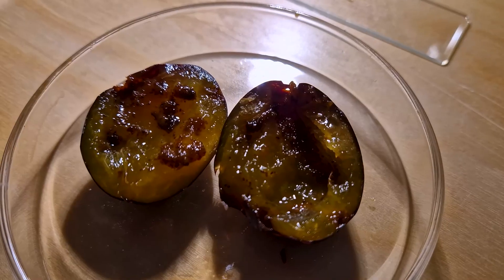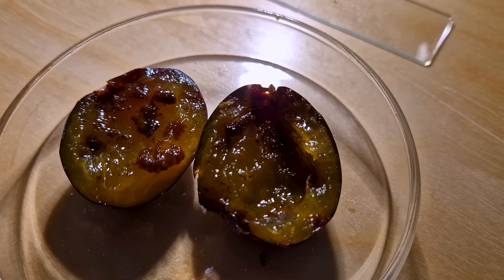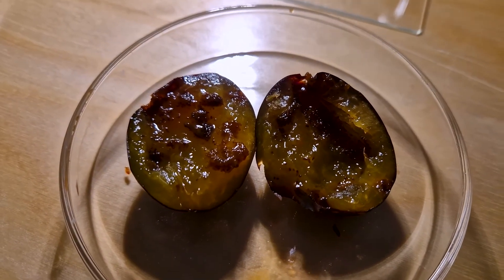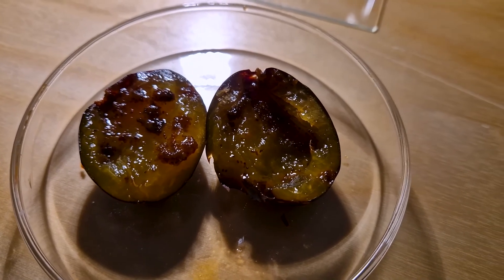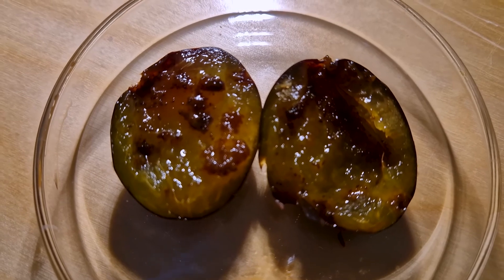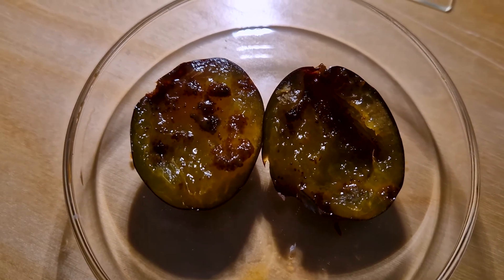But let's get back to those rather unappetizing looking plums. Why do they look like that? I examined the plums a little more carefully and at some point I came across this. Something is eating its way through the flesh here, but what the hell is that? Let's take a closer look.